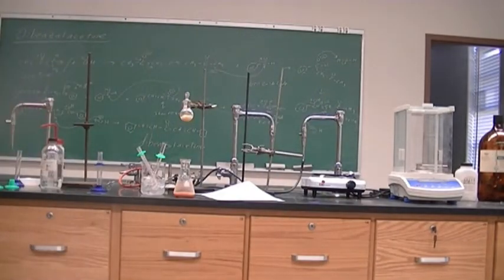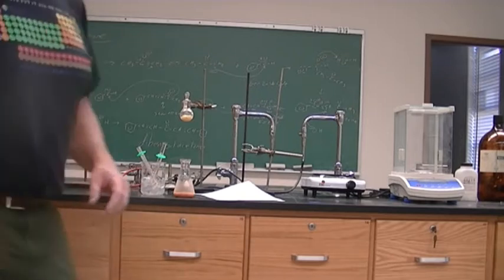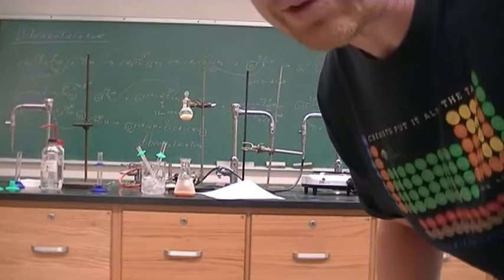Alright, then get our suction filtration ready. From my suction filtration, can you see it over there?